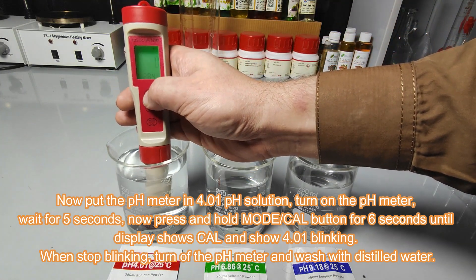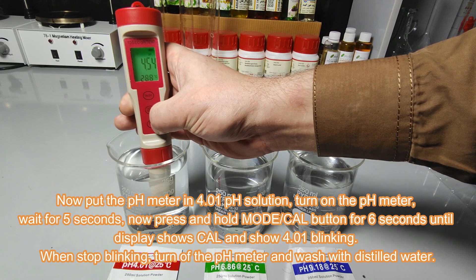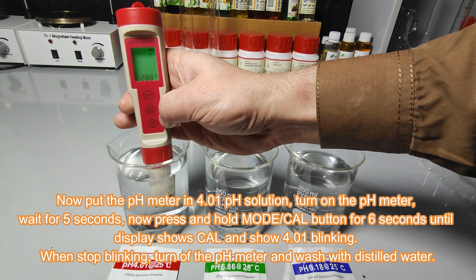Wait for 5 seconds and then press and hold the mode/cal button for 6 seconds until the pH meter display shows 'cal' and shows 4.01 blinking. When the blinking stops, it means calibration is complete.